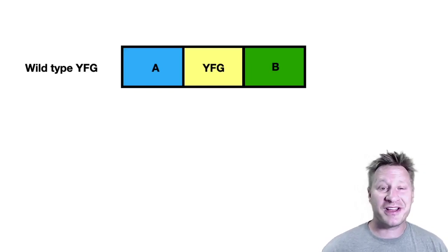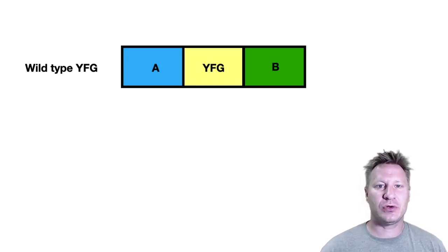All right, welcome. This is going to be a little recording just to show you how to use some fairly common microbial genetics techniques to manipulate a microbial genome in your way of choosing. You can use these techniques to make a clean deletion of an ORF within a genome or any region within a genome. You can use them to do allelic replacement. You can even use them to put new genes into a genome and select for putting new genes into a genome in pretty much any place on the chromosome you would like.